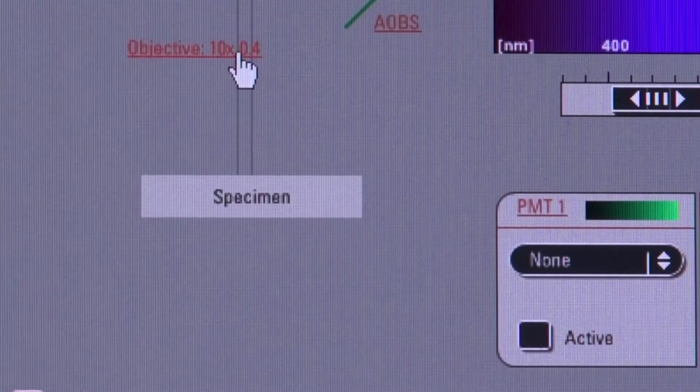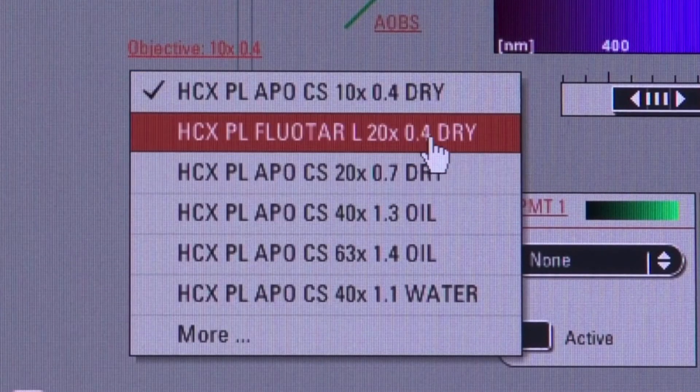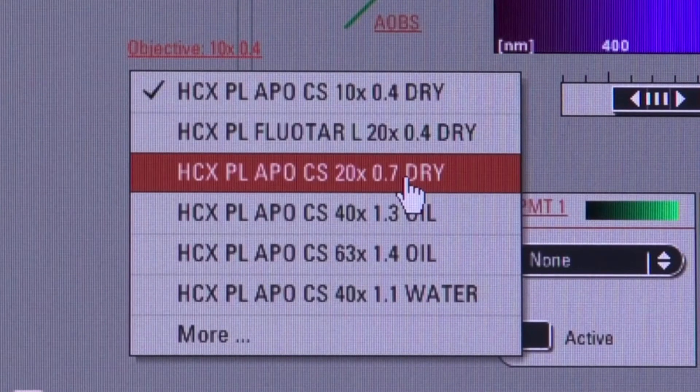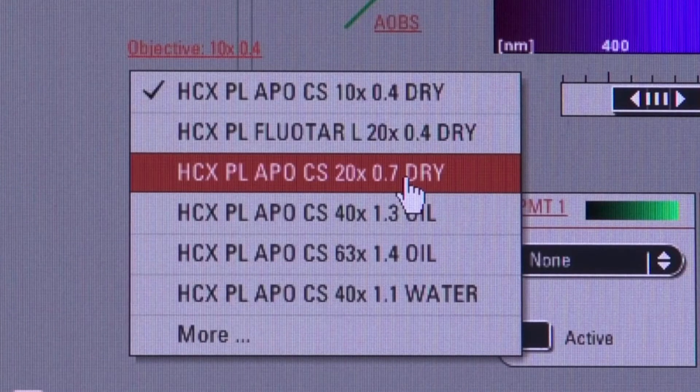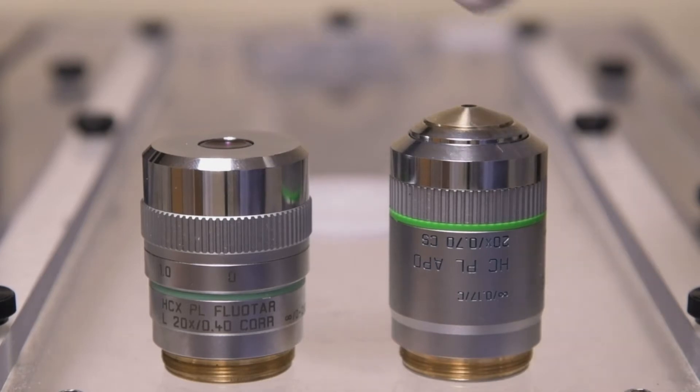Back in the software, you can see that we have two different 20X objectives listed. They are both dry lenses, but one has a very short working distance and the other has a longer one. How can you tell the difference? Take a look at the other number listed next to each objective. This other number is the numerical aperture or NA of the objective. This is a measure of the resolving power of the lens and is actually a more important number than the magnification itself. We always want to use an objective with the highest NA possible because that's going to give us the highest resolution and the highest resolving power. The higher the NA, the more detail we'll be able to see.